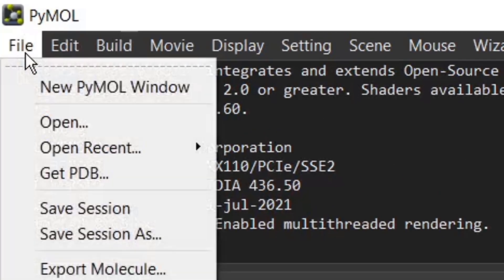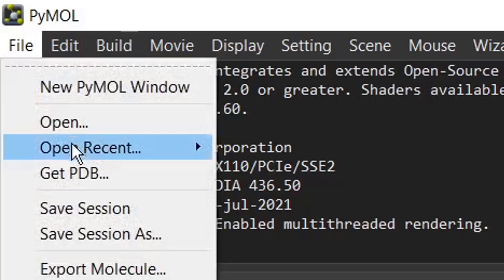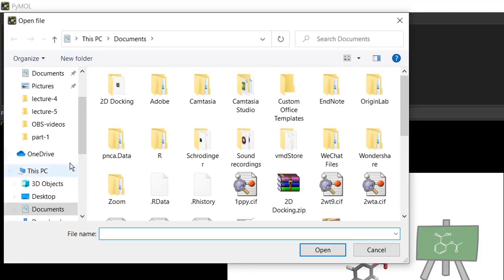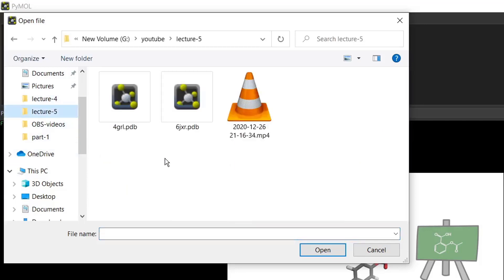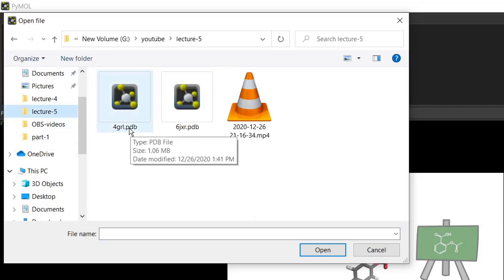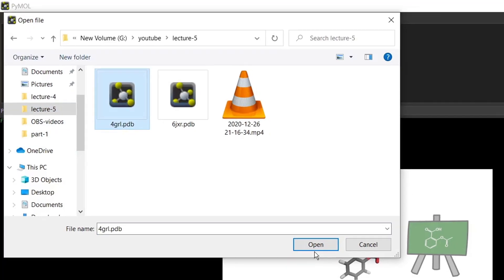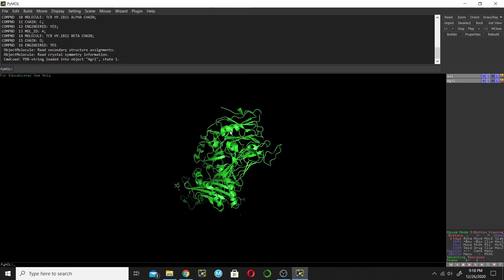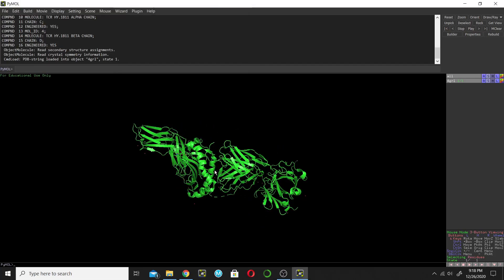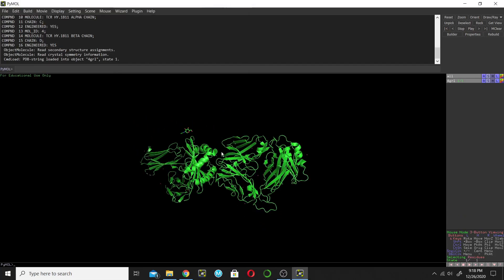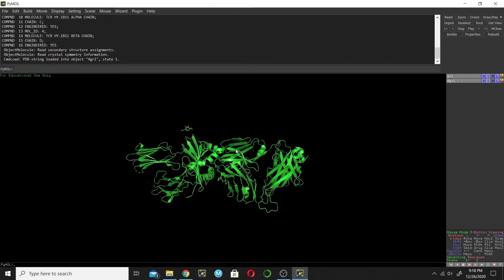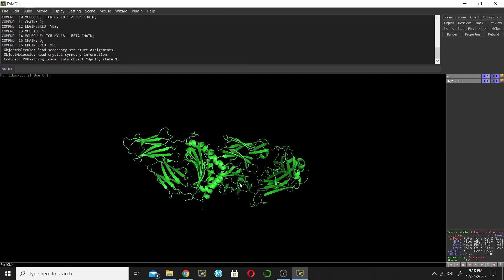Go to the File menu and click Open. Browse for the structure — this is the structure. I want to manipulate this structure. I have opened the structure and now I will find out how many chains are there.